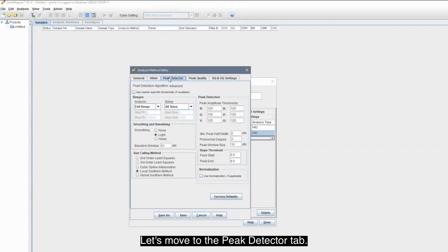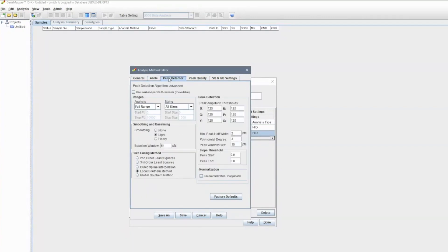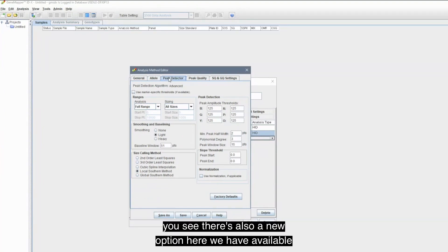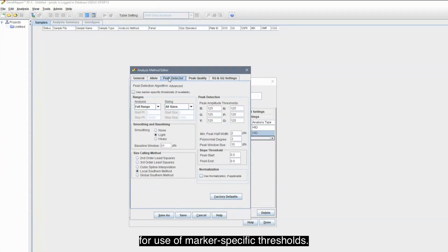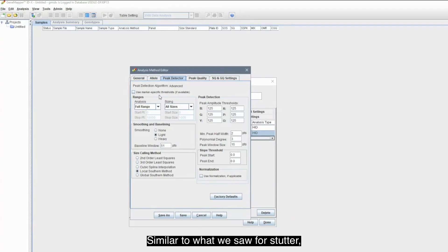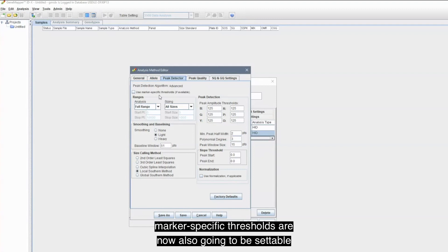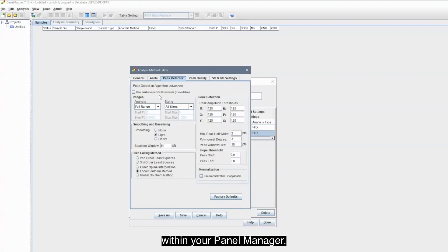Let's move to the Peak Detector tab. In Peak Detector, you see there's also a new option here we have available for use of marker-specific thresholds. Similar to what we saw for stutter, marker-specific thresholds are now also going to be settable within your Panel Manager, which is where we're going to head next.